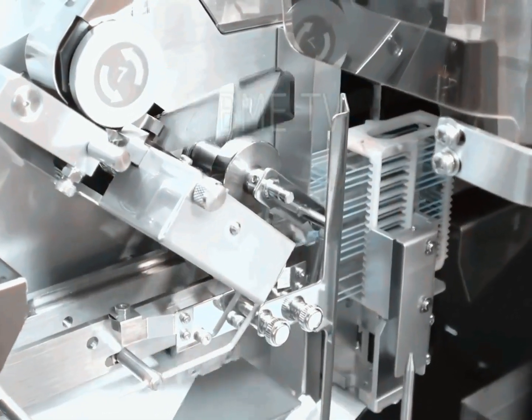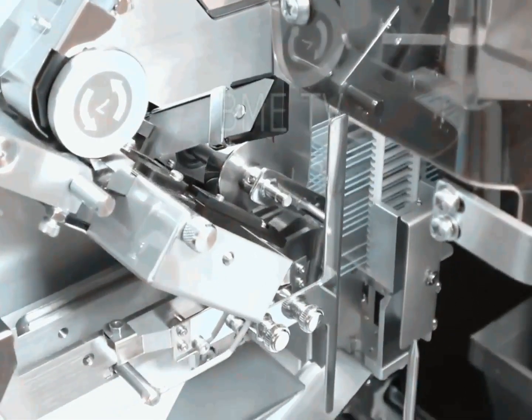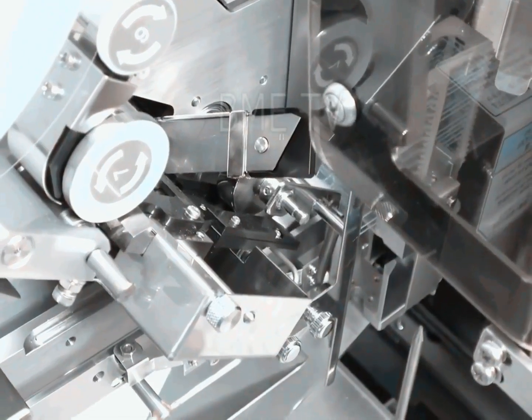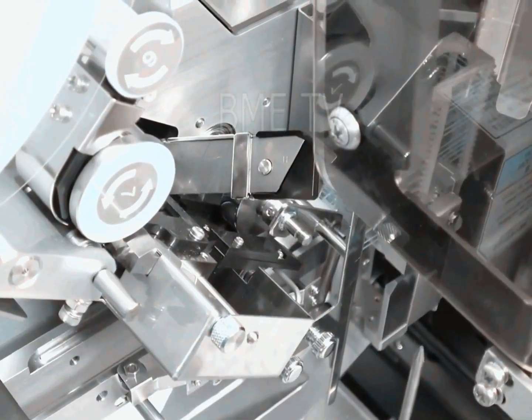Automated systems are described as increasingly closed the more they limit protocols to the use of proprietary antibodies, reagents, and detection systems and restrict the options available in the software to vary the steps of the protocol.